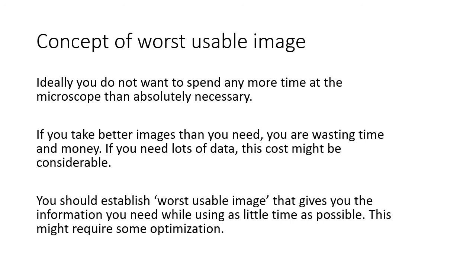Of course, it's better to take a bit too good pictures rather than err on the other side and take pictures you cannot use. But you should also consider what is the worst usable image, what is the quickest image that gives you the information you need. And figuring this out might require some optimization. And if you have lots and lots of samples, this optimization will usually pay itself back really, really quickly.